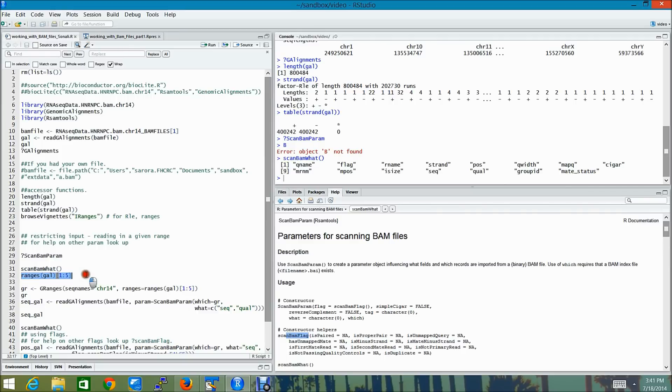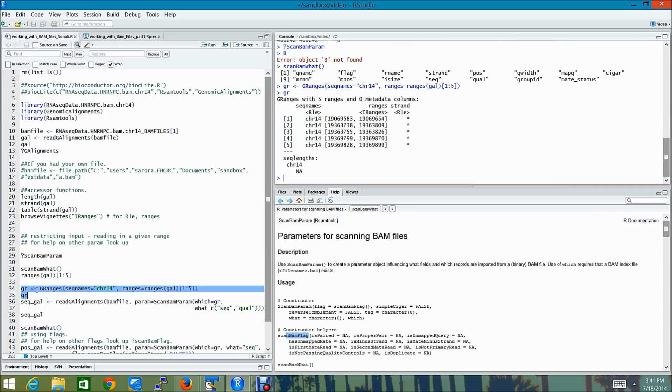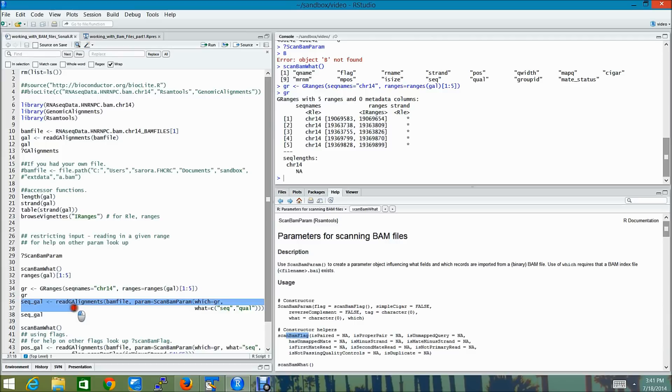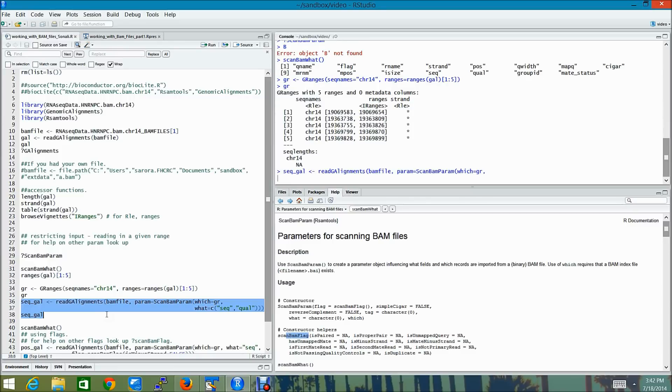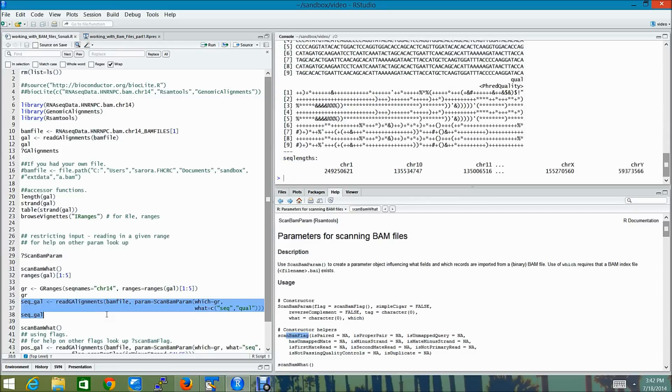Let's construct a small GRanges object containing the ranges from which we want to read in data from our BAM file. This is how the GRanges look. And I'm going to use this variable called seq_gal, which will actually store the data from the GRanges object and the seq and the qual columns.